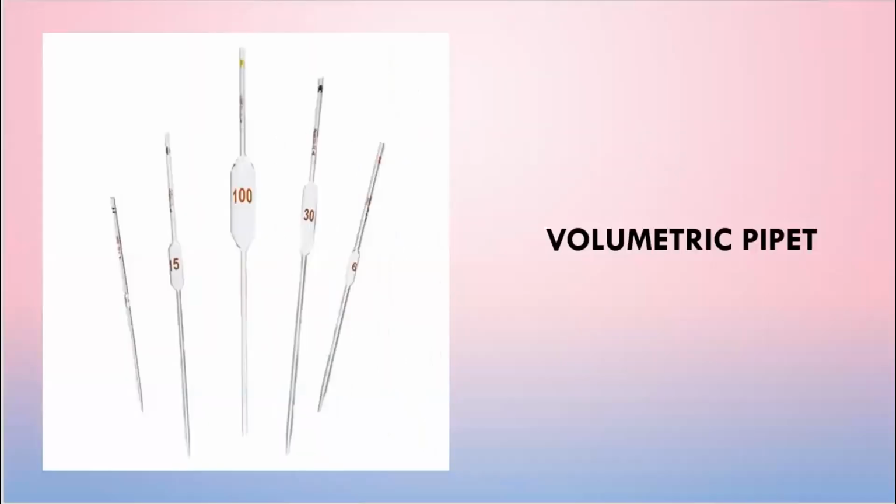Okay. So I hope you can see my screen now. Again, this one is the so-called volumetric pipette. Do not forget, class, na this is used to deliver fixed volume. Isang graduation lang kasi siya.